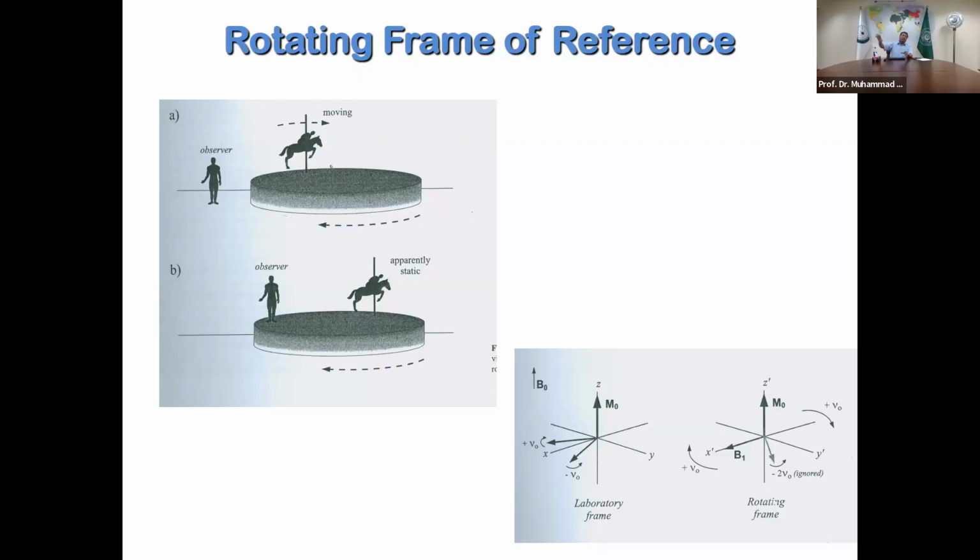Life was very easy when there was radio frequency absorption, continuous wave NMR. But all modern NMR experiments can only be explained by vectors, their position on the XY plane, pulses which differentiate them, and then a detector which records the FID at different time intervals.